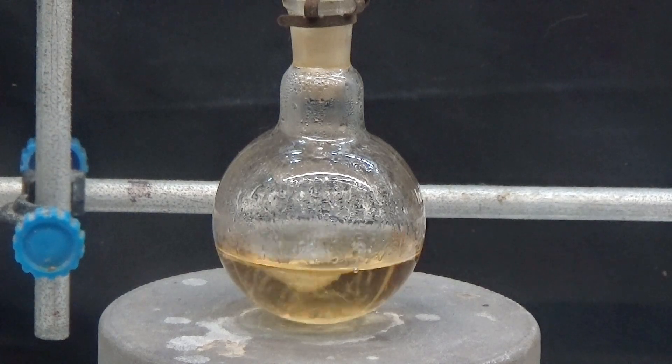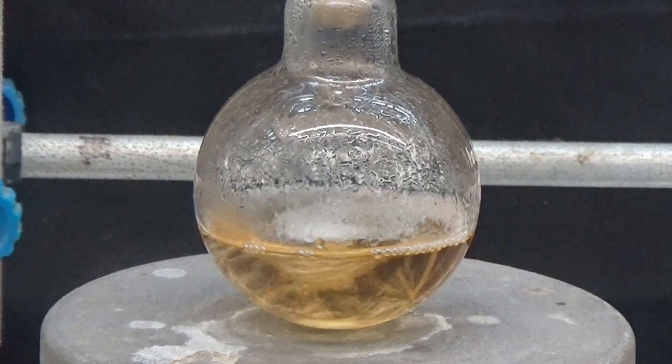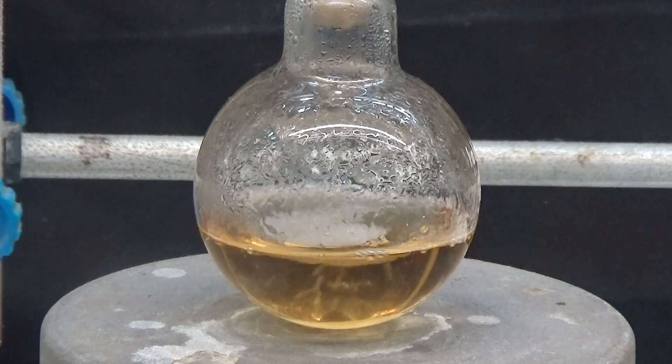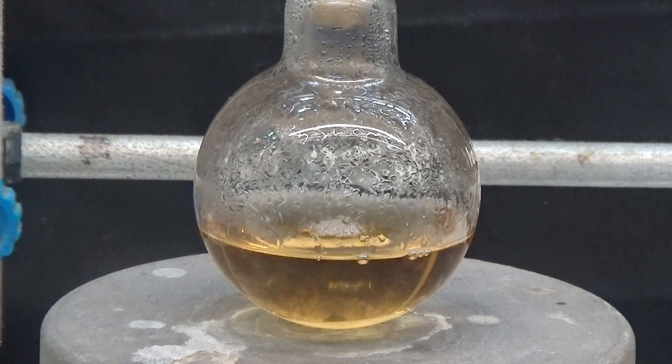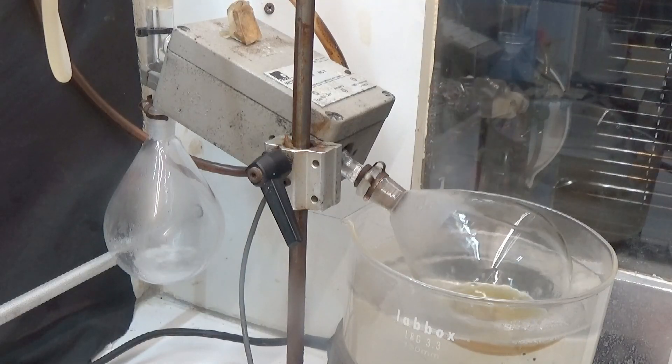Heating it at reflux for 90 minutes is necessary to complete the hydrolysis. Allow to cool and extract with several portions of ether, then dry with sodium sulfate or anhydrous magnesium sulfate. Evaporate the ether in a hot water bath.